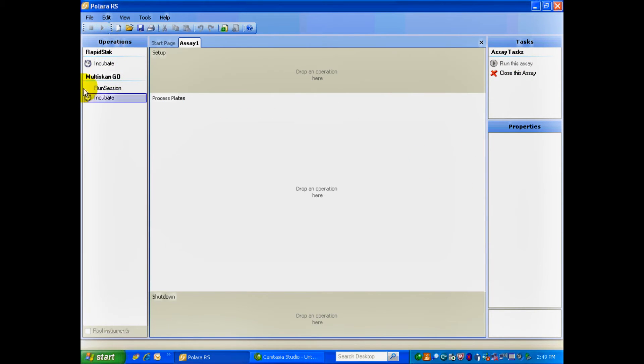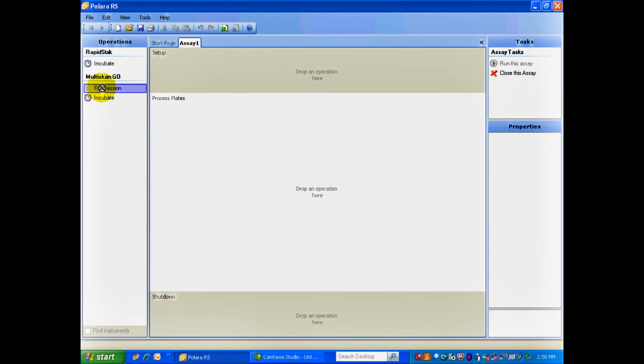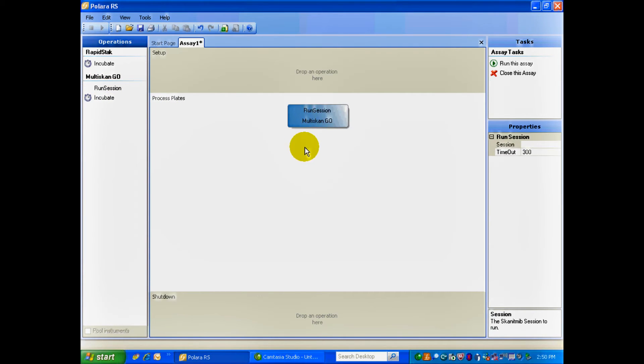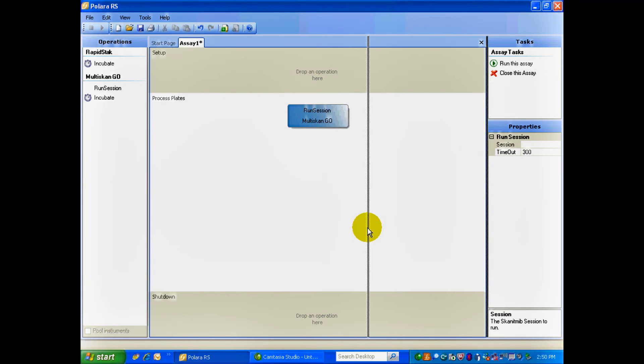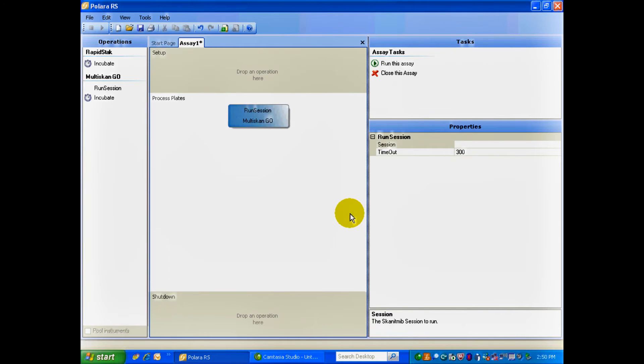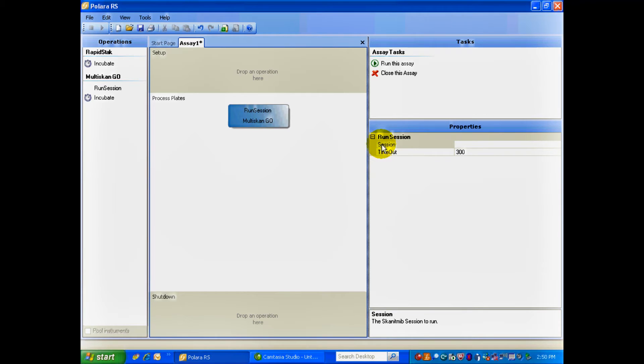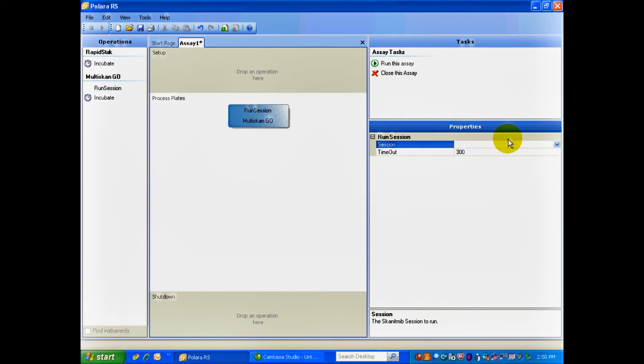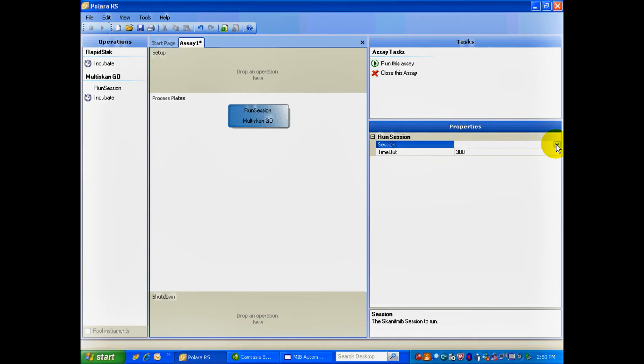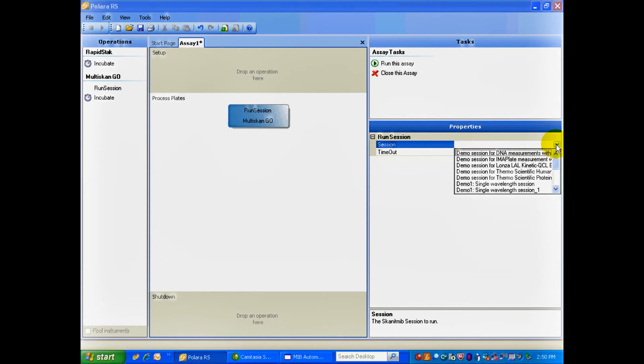You'll see here, on the left-hand side, is the Operations. I'm going to drag and drop Run Session, under the Multiscan Go, into the Process Editor. Now the Multiscan Go and ScanIt has a number of protocols saved in it. To just pull those protocols through, I go to Session, and I click on it. Now it's just going to take a second for Polara RS to communicate with ScanIt and pull through all those protocols.